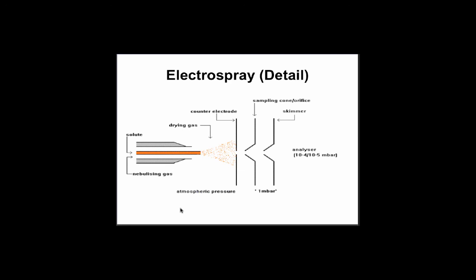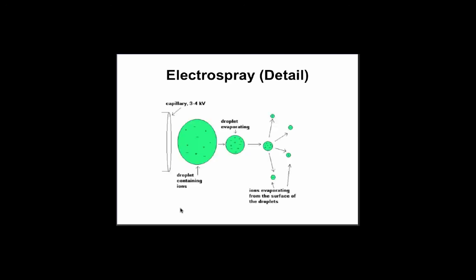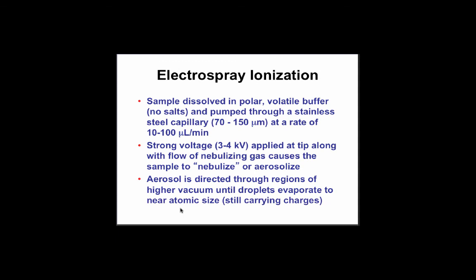And as they're evaporating, they're also propelled forward using a whole series of electronic plates that have different charges that accelerate the ions. So things are sprayed out, the equivalent almost to an aerosol can. The droplets start drying off because they're now in a vacuum, and then they've gone through these accelerator plates, electric fields to move out. And eventually what happens is that these droplets evaporate down to just a single ion. And those single ions are the ones that you're detecting.